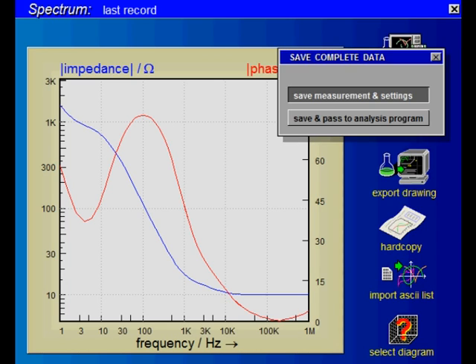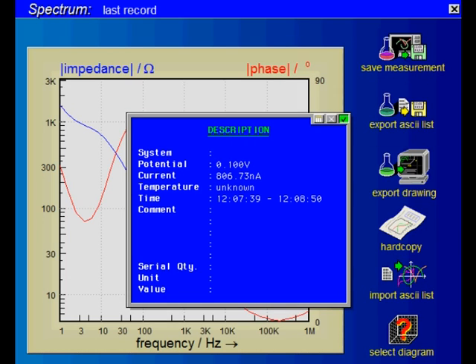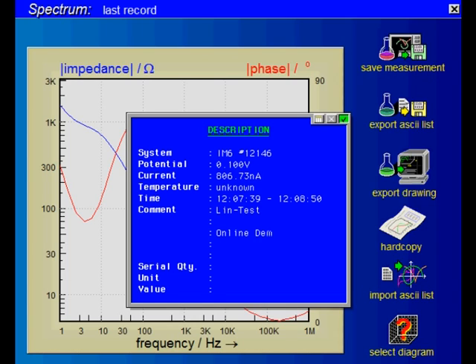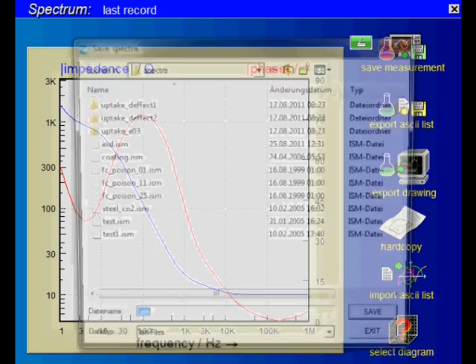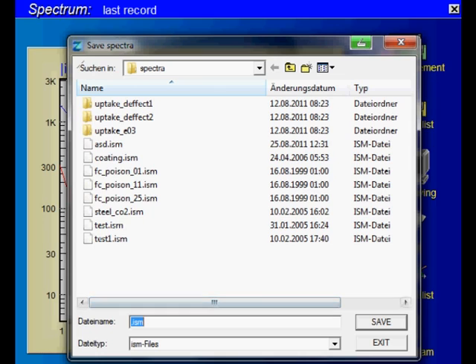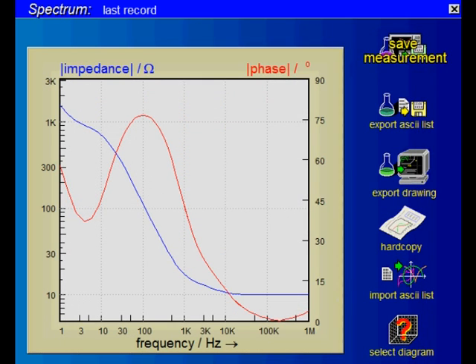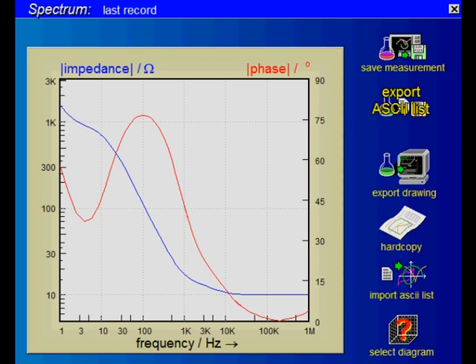Now you can save the measurement data. Each file also contains a comment block you can fill before saving; the time of measurement and the DC parameters are filled by default. In addition or alternatively, you may save the data in ASCII text format in order to import them into any third-party analysis software such as Excel or Origin.